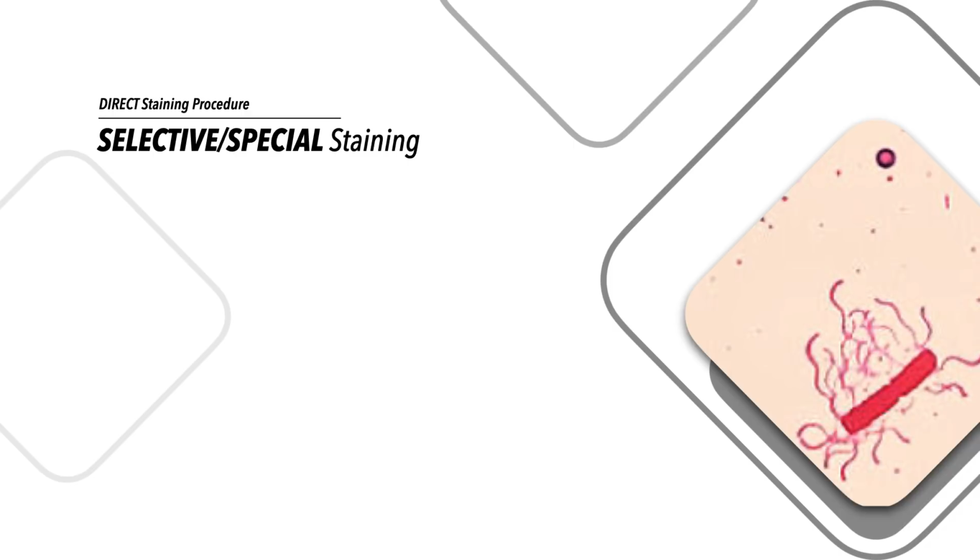Now, last on the list, we have your flagellar stain. Okay, your flagellar stains, guys, are there to really help us examine, or to really see the flagella, because in reality, guys, your flagella are so thin. Okay, these are hair-like structures that help propel the bacteria forward. These can be long, as I said, sometimes they would appear longer than the actual bacteria itself. However, they are very, very thin that you cannot really see them sometimes. So, your flagellar stain helps us to better see them.